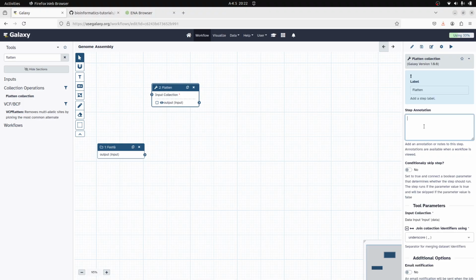Here I'll just leave it as it is. Once you have it, don't forget to save whatever change you make. Try to be saving so that you don't lose some information going forward. If you do too many changes without saving, you tend to forget. So just a little activity and then you save.